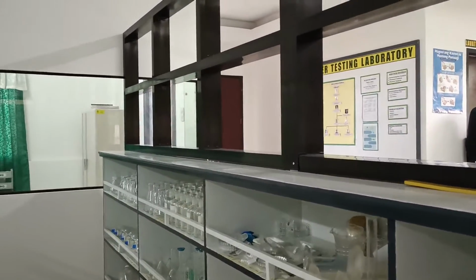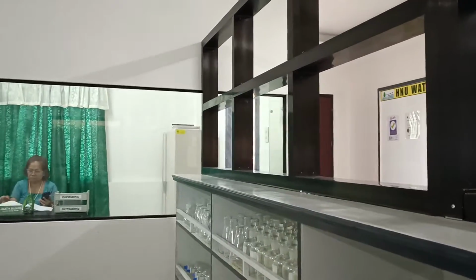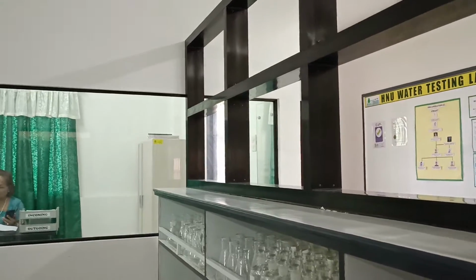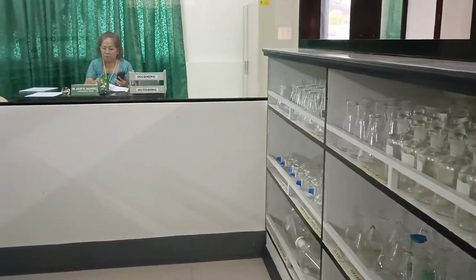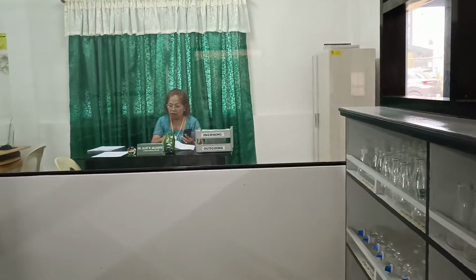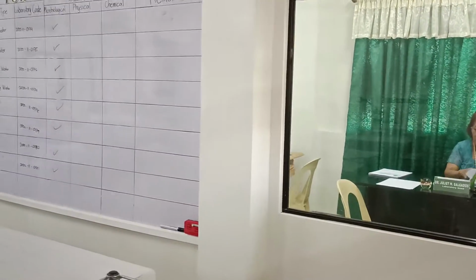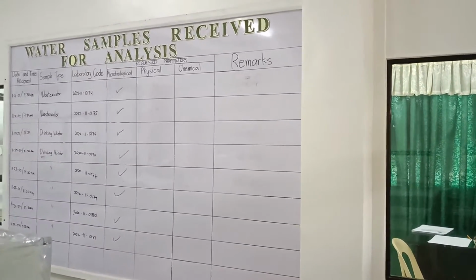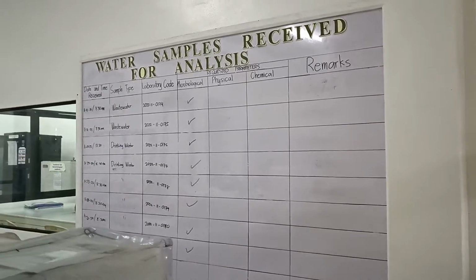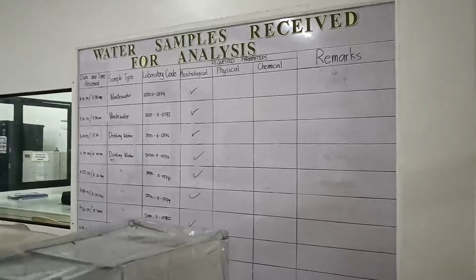Moving further, we see again the glass panels, which allow us to see the inside of the laboratory manager's office. Beside the glass panel is a whiteboard, which shows the list of samples and the various tests requested.